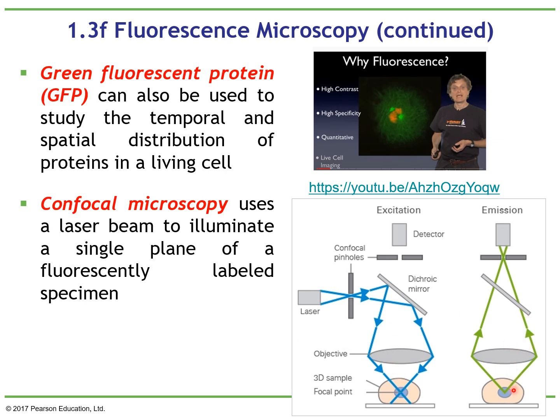Then you use this mirror to transfer the light to the sample, and the light that is emitted also has a pinhole, so it's not saturated, and there is just the correct amount of light to see the sample.